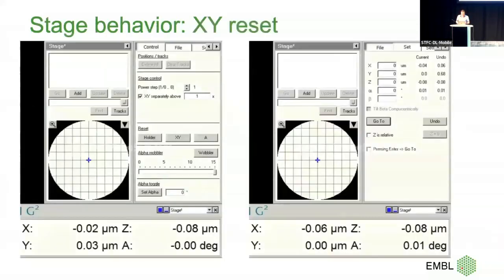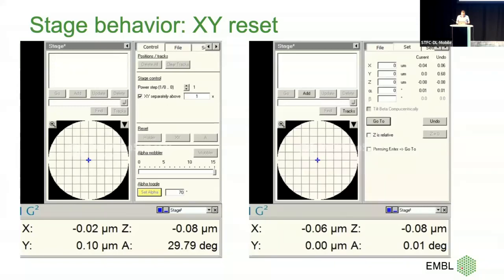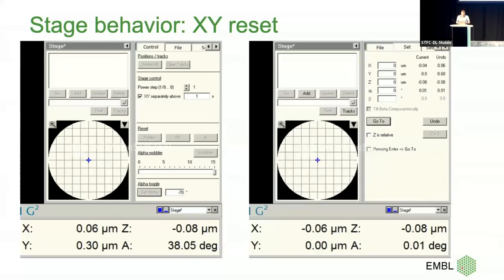At the time we were averaging 45 to 50 minutes per tilt series on a K2, ±60° range, 41 images. One thing I noticed early on is stage behavior: if you put in a 70° tilt, you can watch alpha changing and then Y on the stage also changes — it's a real movement. When you tilt back, you're left with quite a lot of shift, because the software was just moving alpha and the mechanical design of the stage pushes Y.